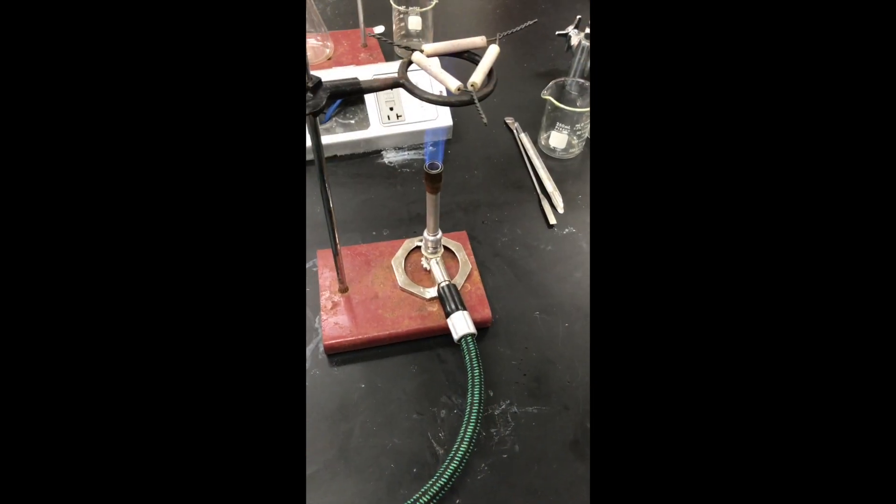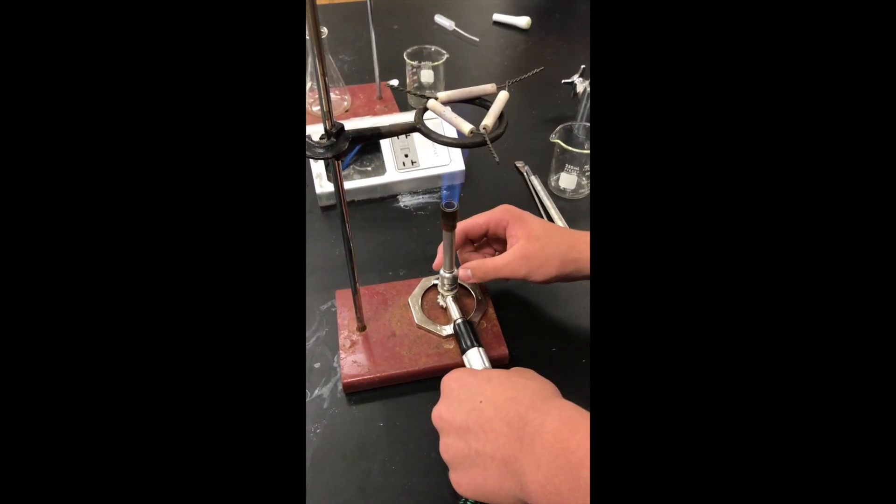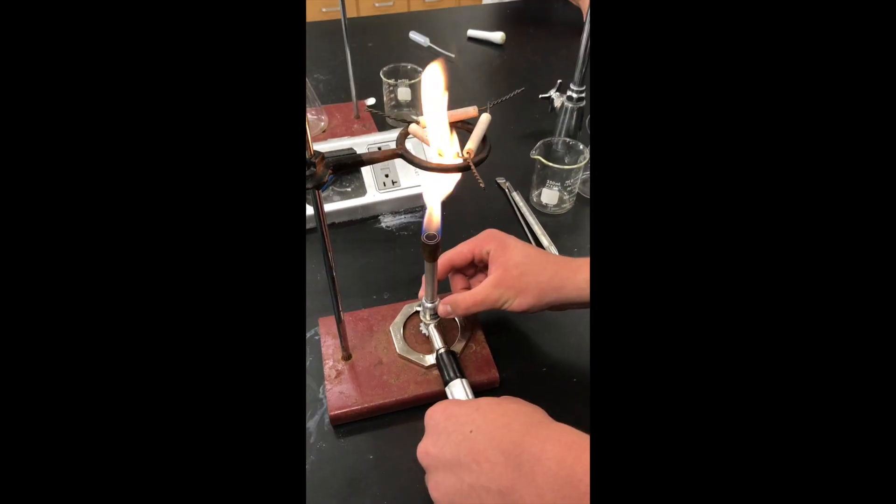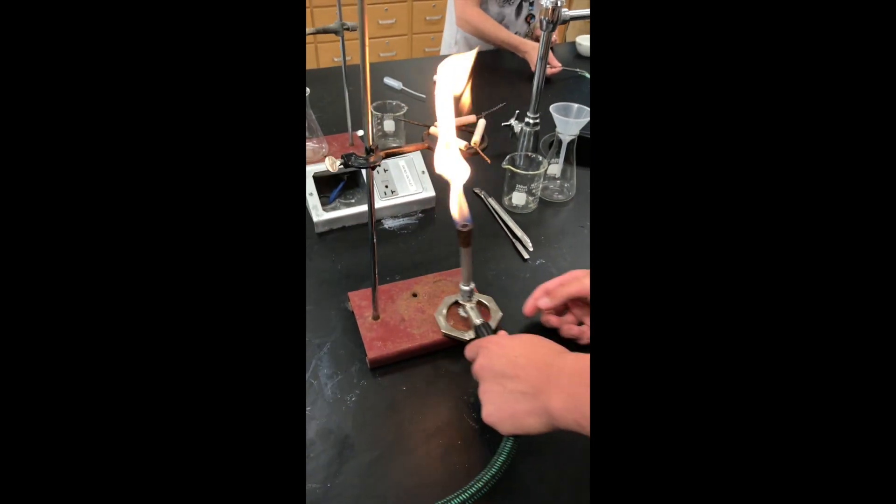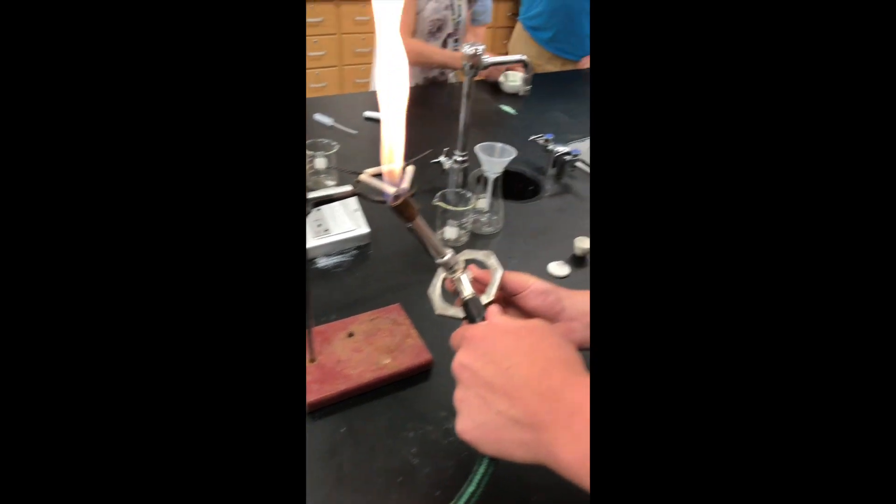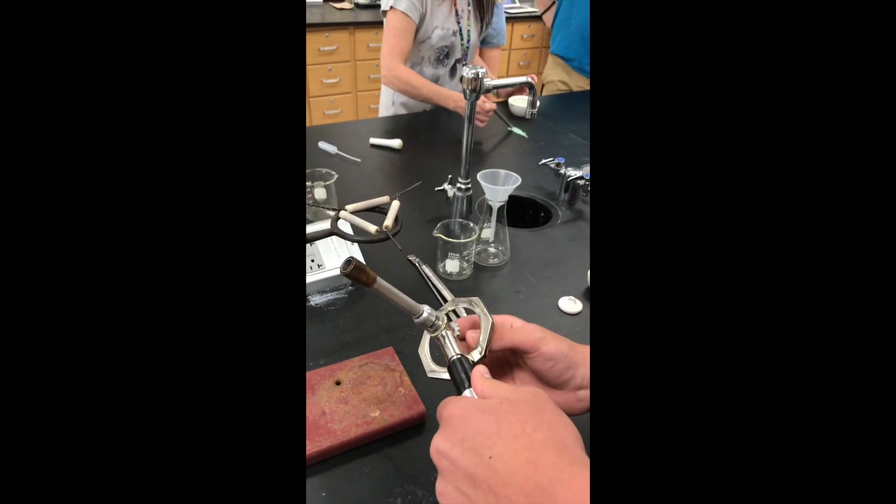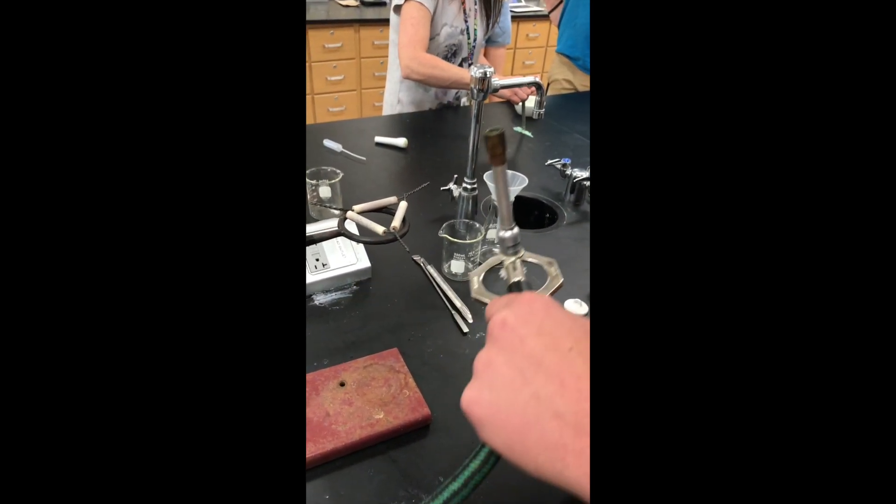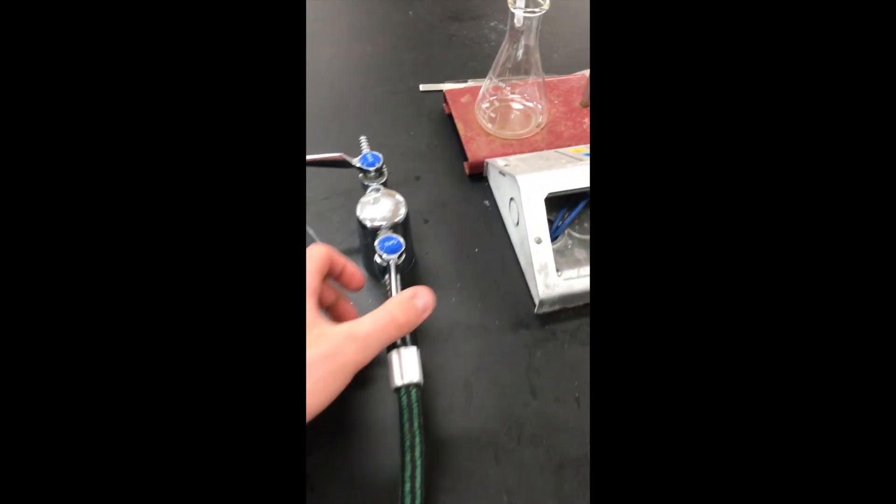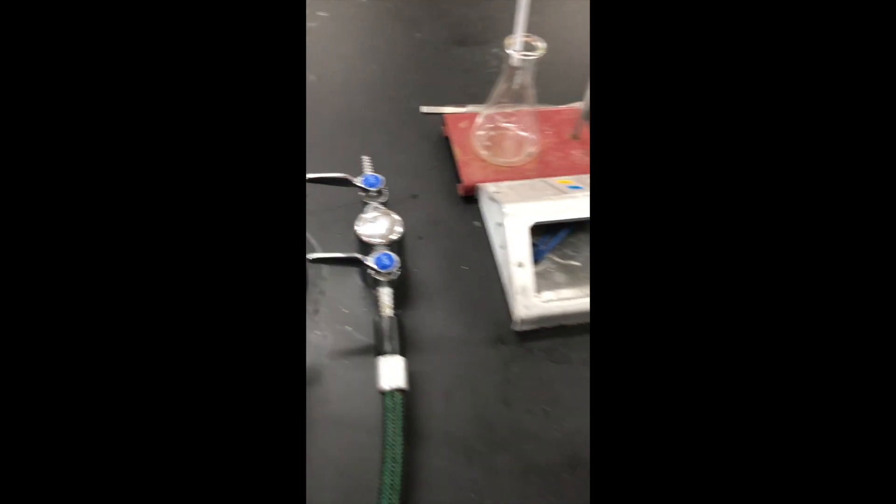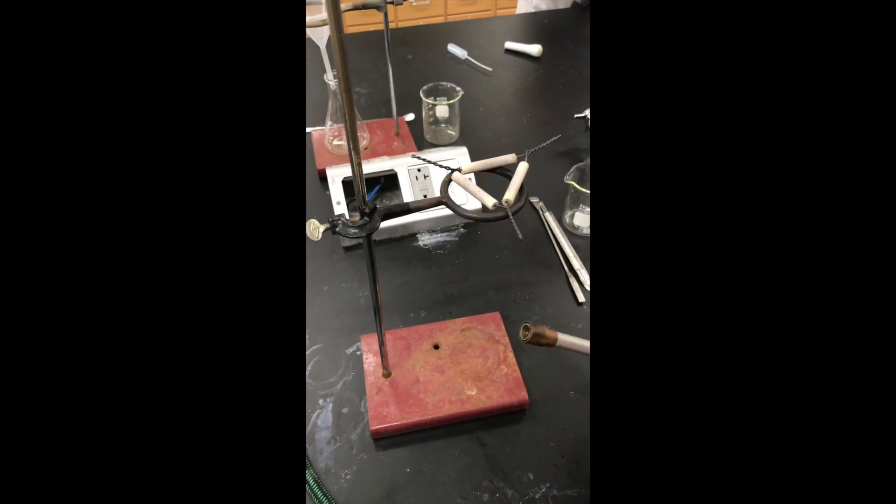Turn off your Bunsen burner and disassemble your set. You will turn it left to suck the oxygen, and then you will turn off the Bunsen burner on the bottom. Make sure that it is cut off, and then you will turn the gas off. And it is all disassembled.